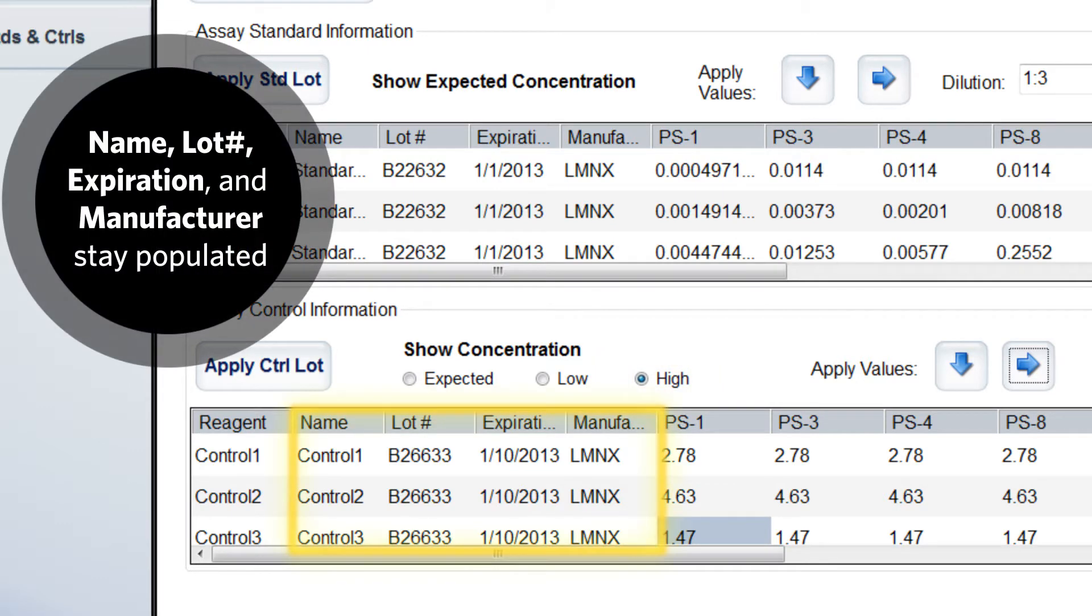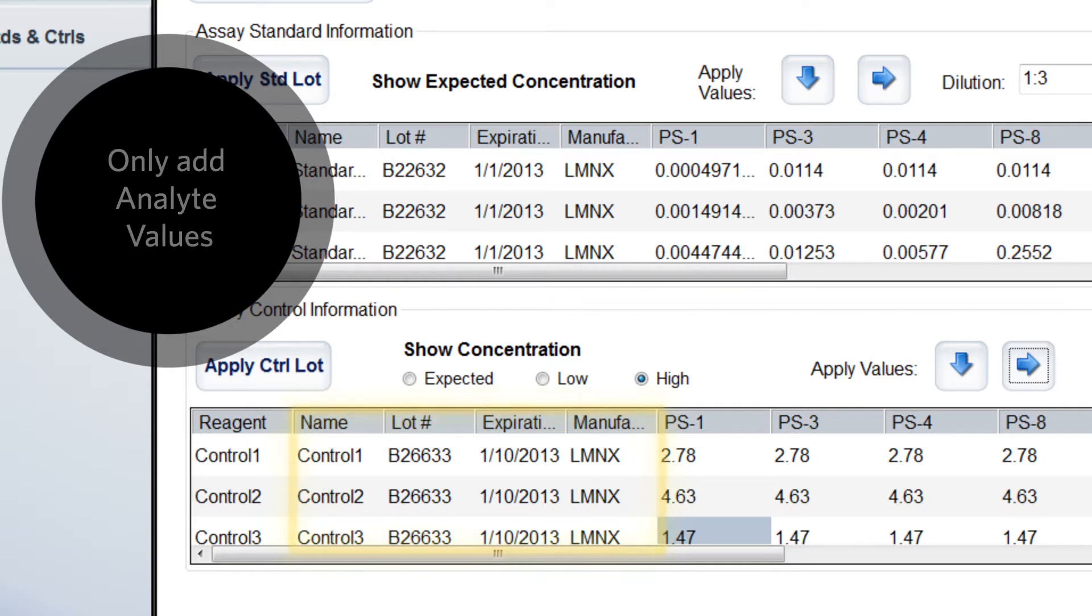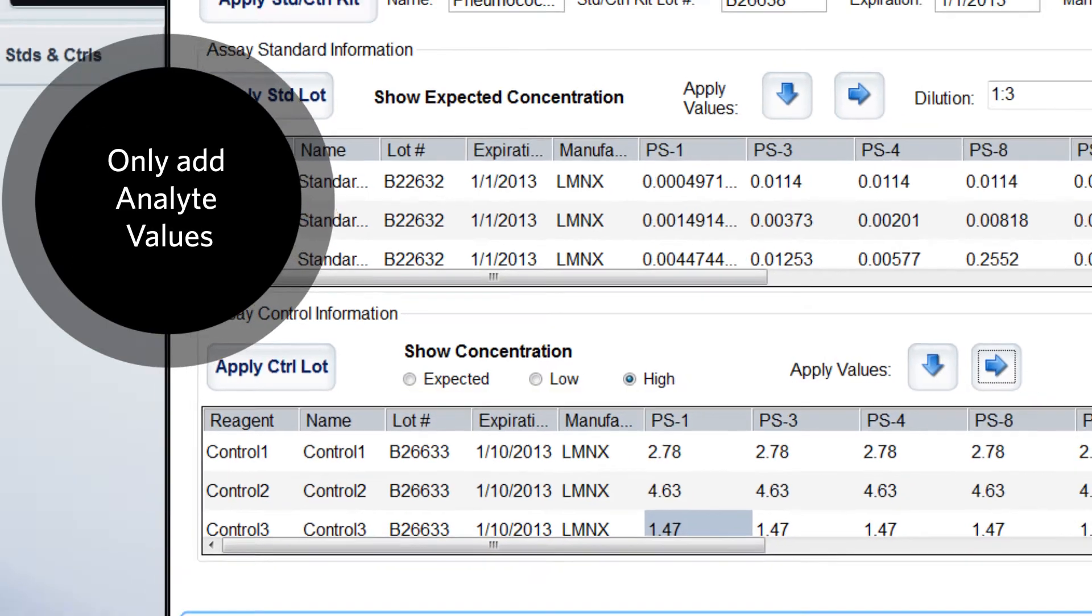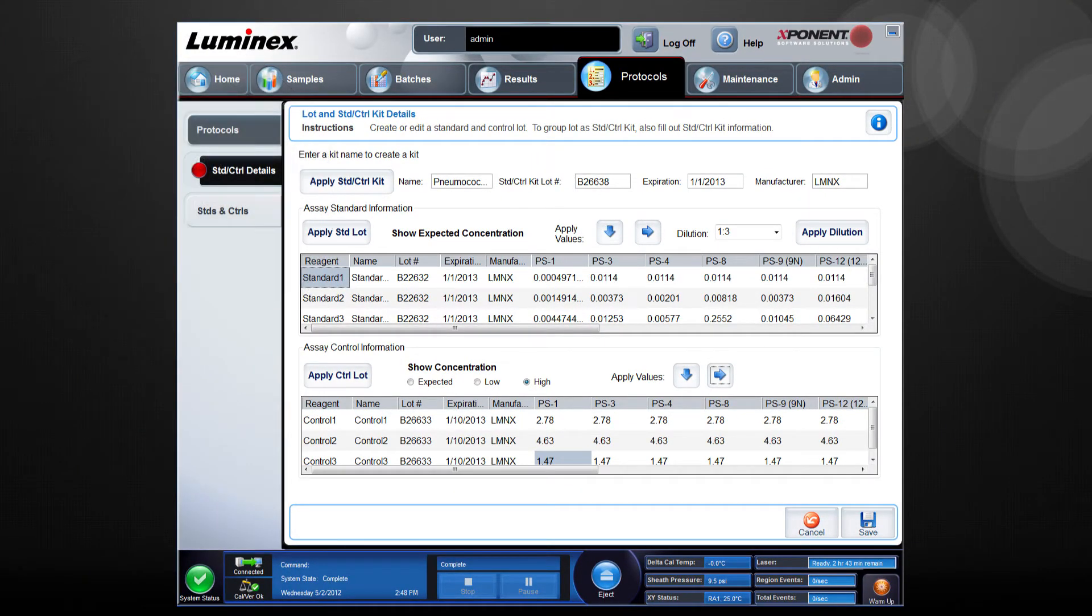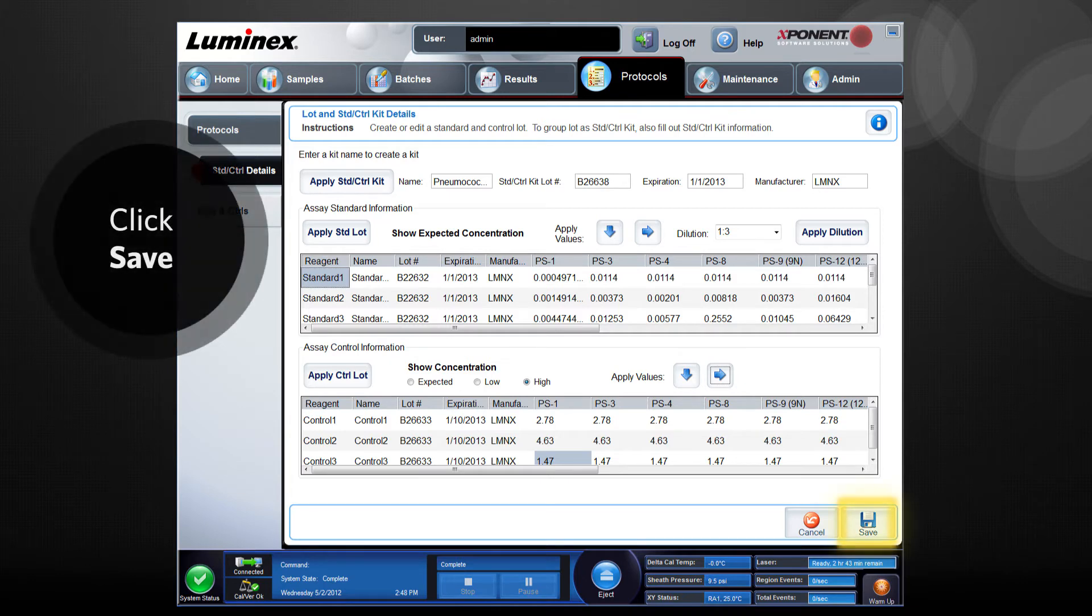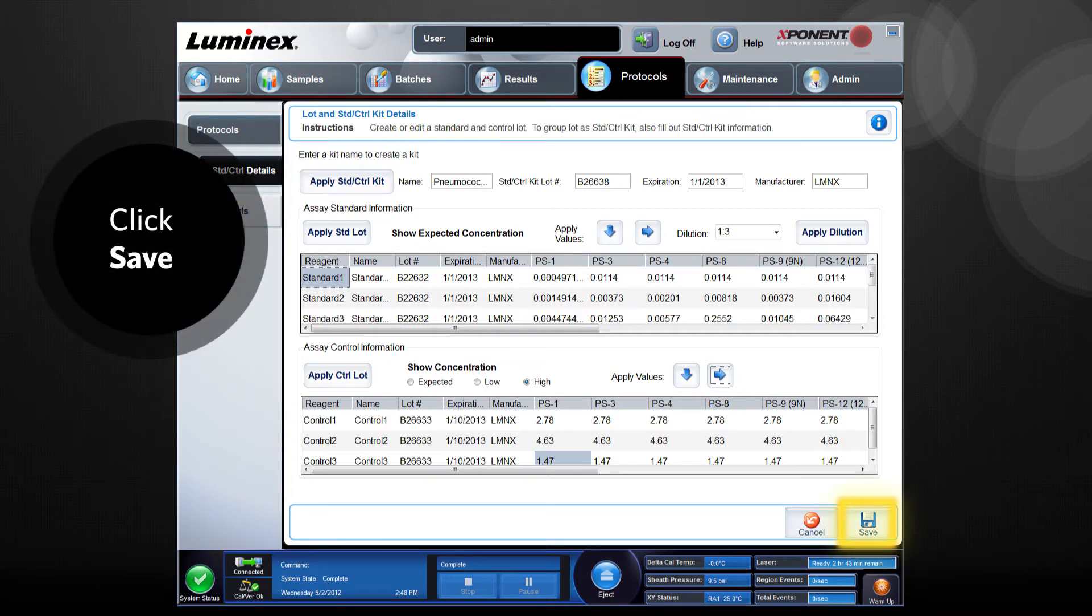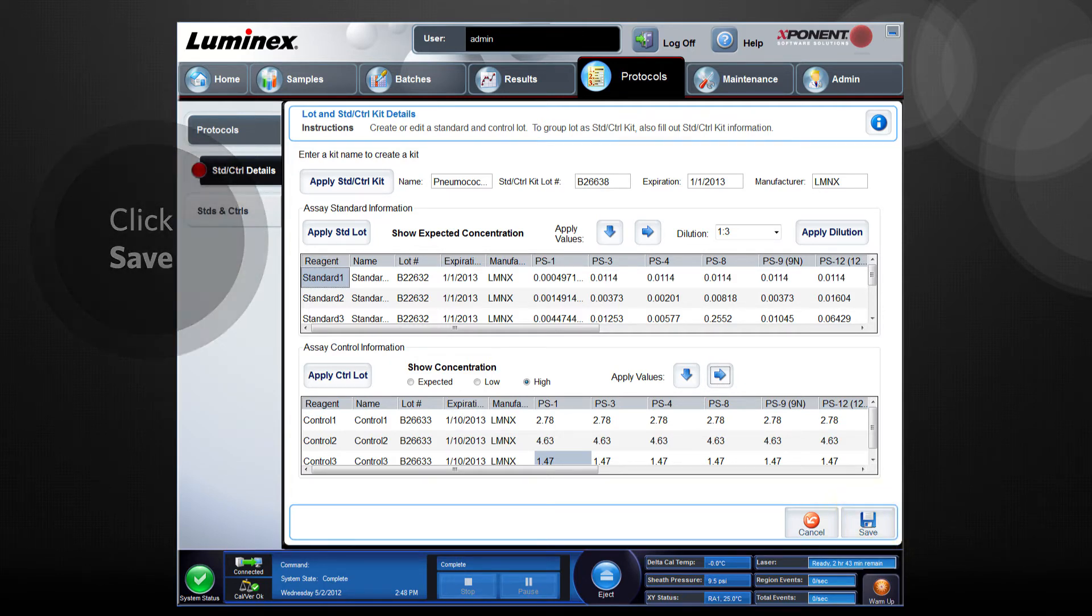The name, lot number, expiration, and manufacturer information stays populated, so the analyte values are all that need to be added. Click save to save the standards and control.